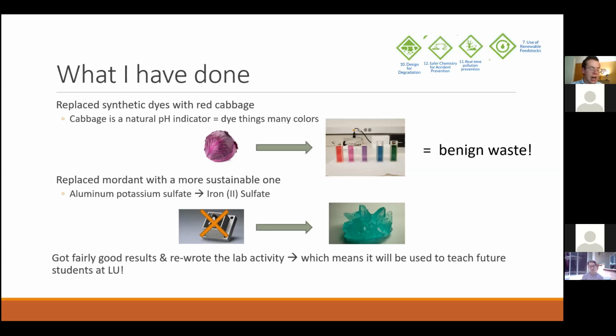Something I should note is that this lab had been the greatest producer of hazardous waste in the department, and now it has nearly zero hazardous waste, with the exception of that solid iron(II) sulfate. And so that feels really good, and like I can be proud of this.